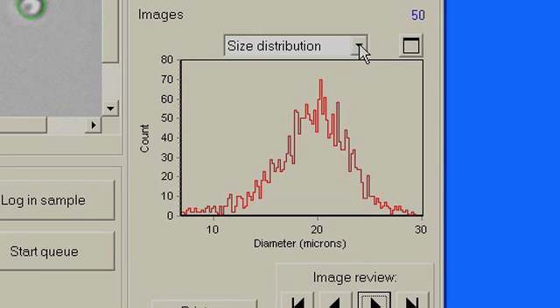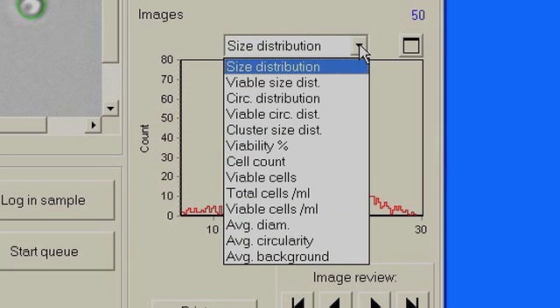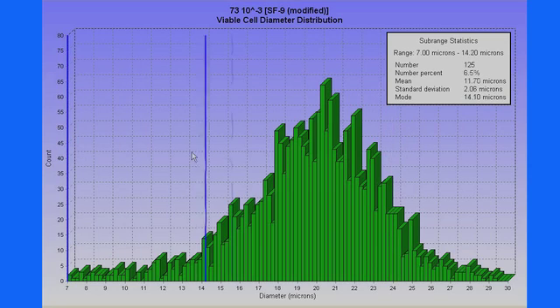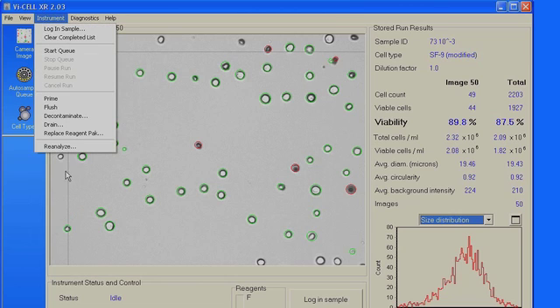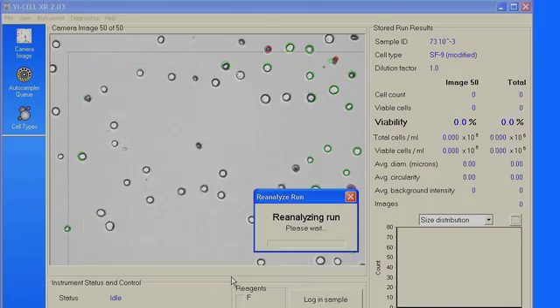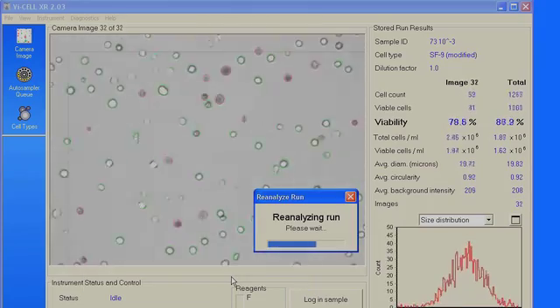The drop-down menu offers a variety of graphs such as size distribution, viable size distribution, total cell concentration, and many others. Each graph can be expanded to give additional information. The ViCell XR offers the advantage of allowing the operator to review and reanalyze the sample using different cell parameters without having to rerun the sample.